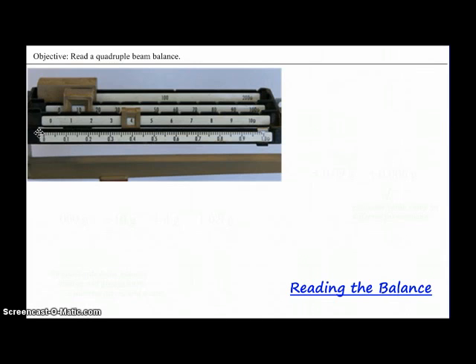You'll see that the numbers represent 1 tenth of a gram. The lines between those numbers represent 1 one-hundredth of a gram. And the space between those lines represents 1 one-thousandth of the gram. So let's go ahead and let's read this balance.